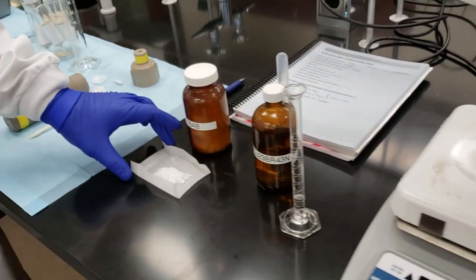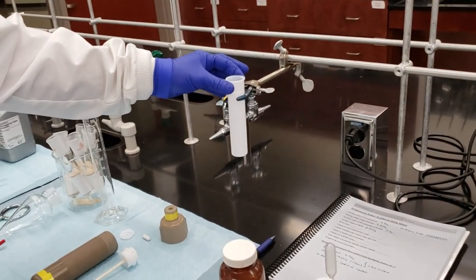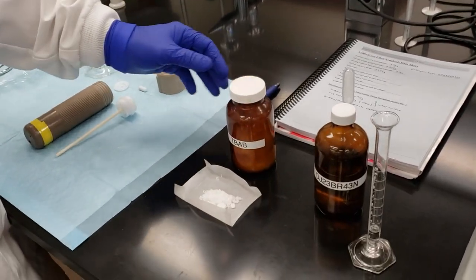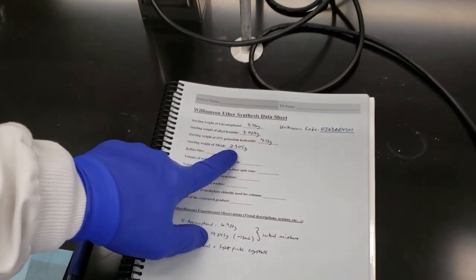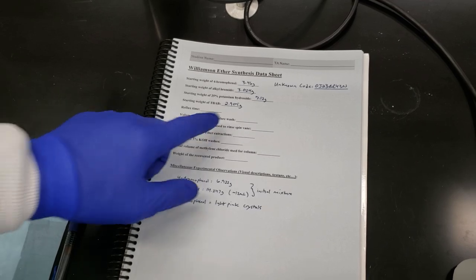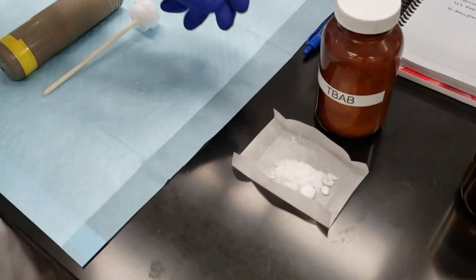We start with our TBAB. We're going to go ahead and set up our Teflon reflux vessel here that we're going to put into the microwave. We've measured out a total of, let's look at our sheet here, 2.905 grams of our TBAB. This is our tetrabutyl ammonium bromide. So that's our white crystals right here on our weigh paper.